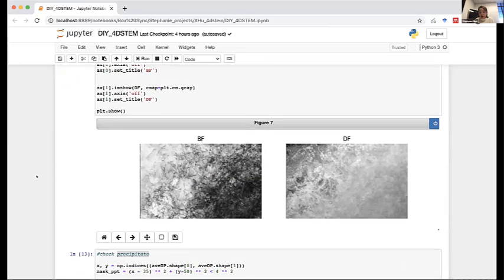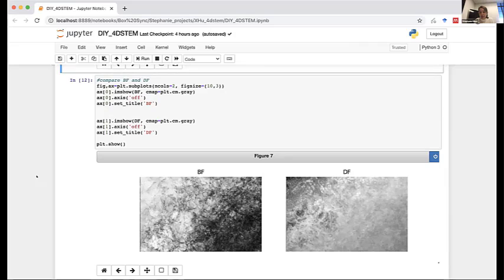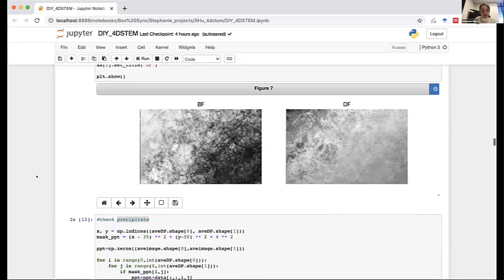So now we're going to do the same thing again, but we're going to do it slightly differently. We want to get a little bit more information about the sample, and we're going to use detectors. We're going to do a special type of dark field where our detectors are tuned specifically to our sample. Again, this is much like what Anna showed to do in Digital Micrograph. So we're going to look for precipitates in the sample.